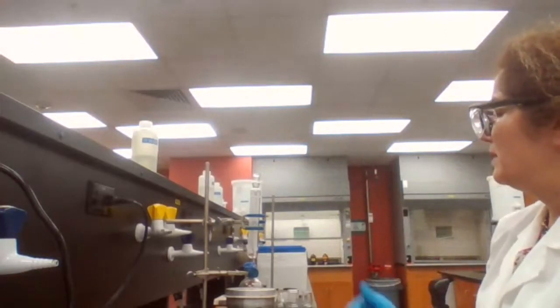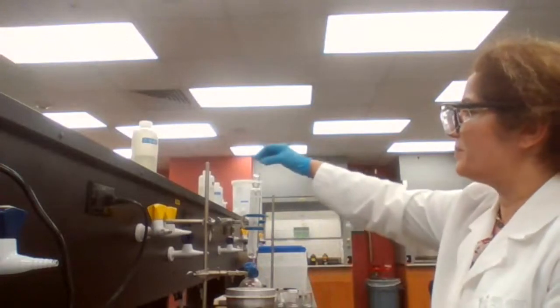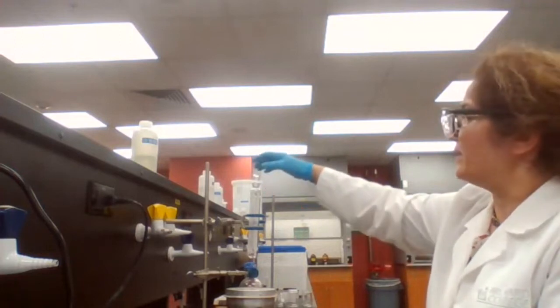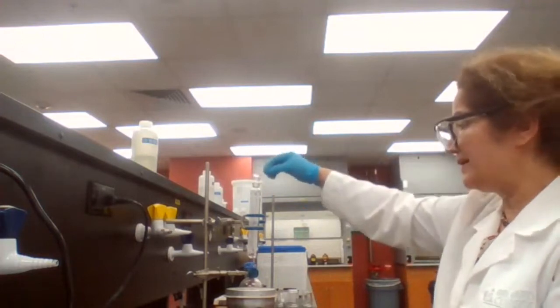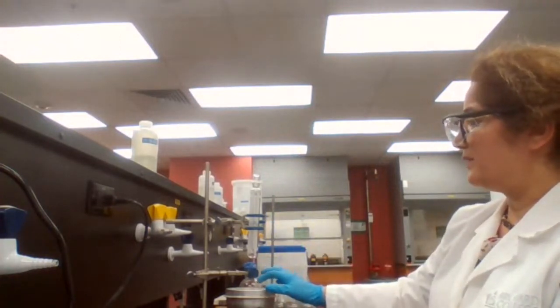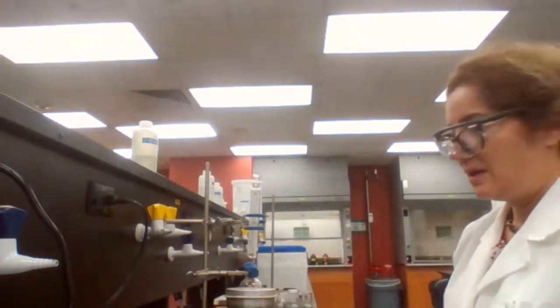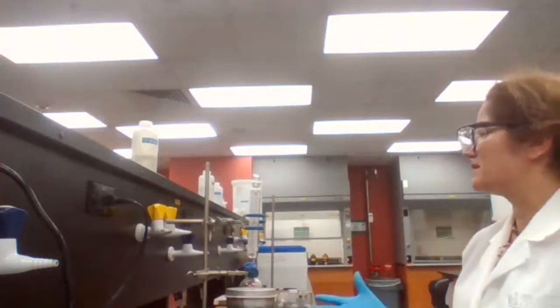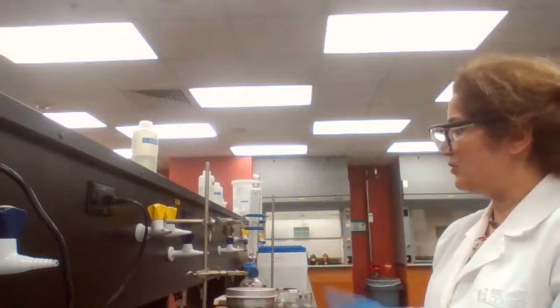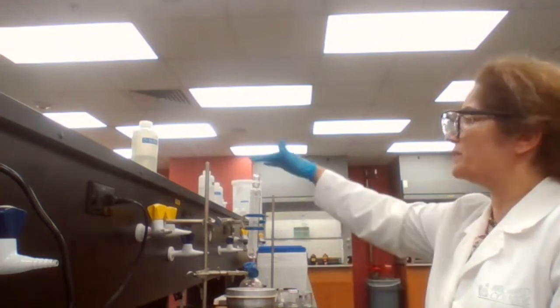And to assemble the reflux, again, greasing the glass joint is very important. You should never put any stopper at the end of the condenser, because this condenser end is open. You don't want to block it. If you block it, the vapor that is produced inside the boiling flask can build up high pressure. It can break the glass. It can cause other accidents and incidents. So boiling should never take place in a closed container. That could be distillation, or it could be reflux. So this is an open system actually.